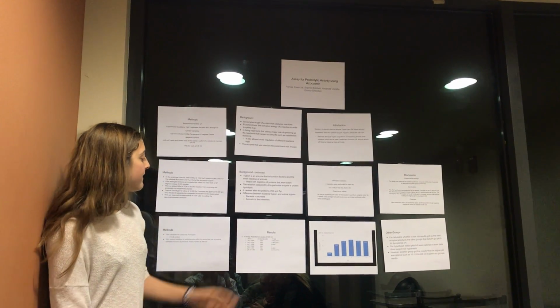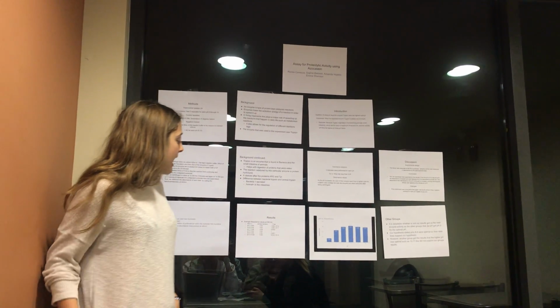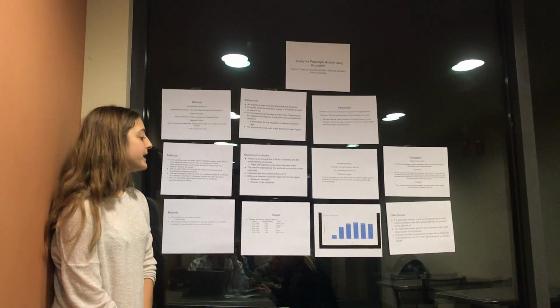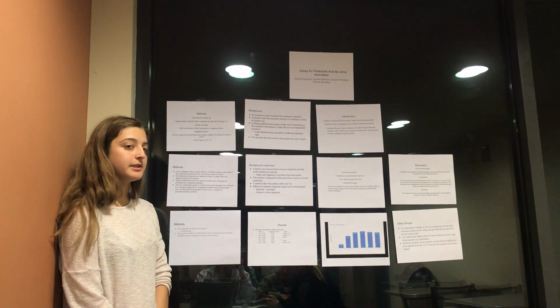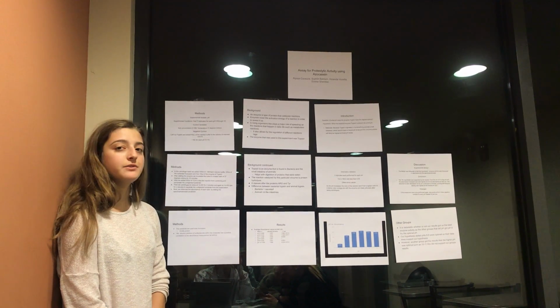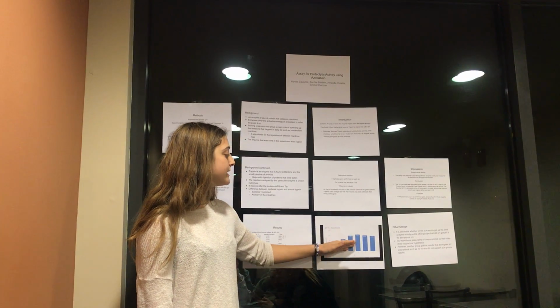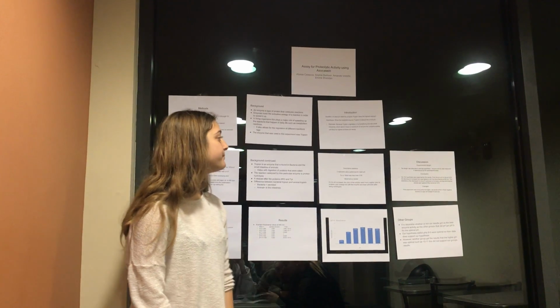Our results were that from pHs 5 to 8, the averages increased, while at 9 and 10, they then decreased. Our standard deviations were less than 0.01, indicating that we had very low variability. Our t-tests were also less than 0.01, indicating that all of our solutions were statistically significant. As you can see in the bar graph, from pHs 5 to 8, the absorbance is increasing, and it reaches the highest peak at 8, and then decreases from 9 to 10.